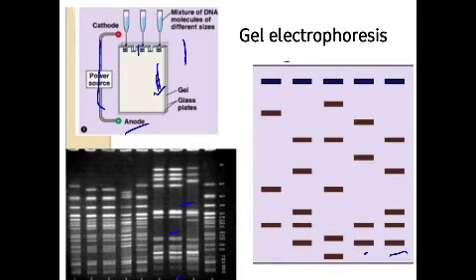So gel electrophoresis is a technique in which the DNA will be separated according to its size, and we can get a purified form of DNA. This very pure DNA fragment we can utilize for further construction of recombinant DNA. These small parts of DNA we will be joining with the DNA of certain vectors, and after that multiplication of our desired DNA will occur.